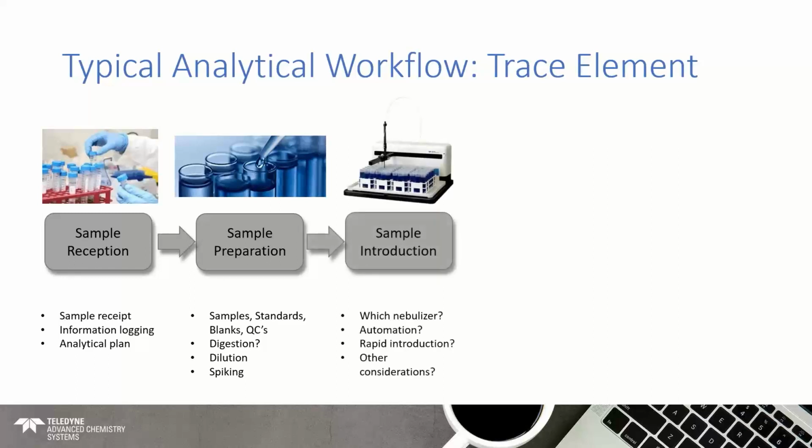So the next step, once you've prepared your samples, you need to introduce them. You need to then feed them into your ICP instrument so you can generate your data. But again, here's an area where there's a lot more thinking required than you might think there would be. Depending on the sample that you've received and the kind of state that it's in for introduction, in terms of a liquid introduction, which is what we're considering today, there will be a nebulizer and spray chamber arrangement that's sat between your samples and the ICP essentially.